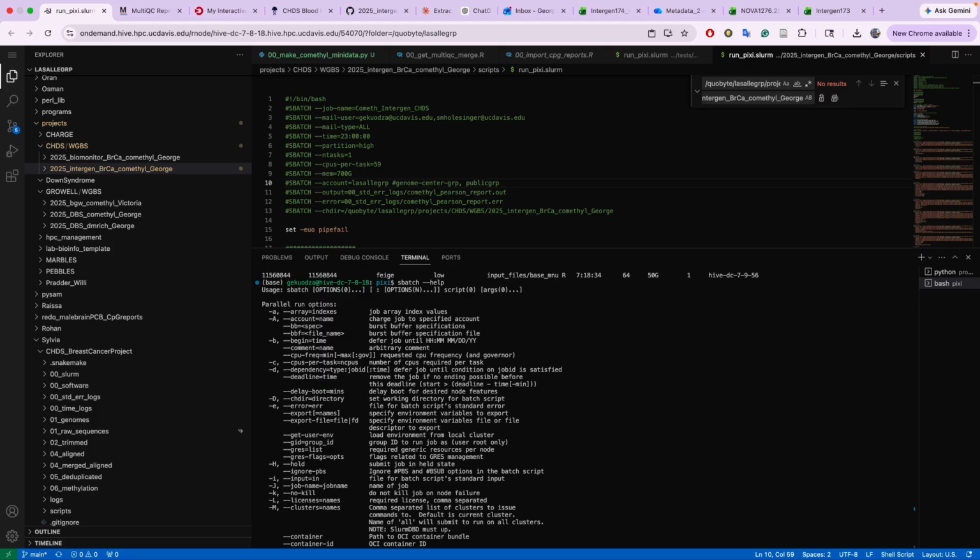So I think on the public group, there's also no limit, and you can run stuff for more than 3 days in the public group. But anyway, I think most of the time the Genome Center is usually available.